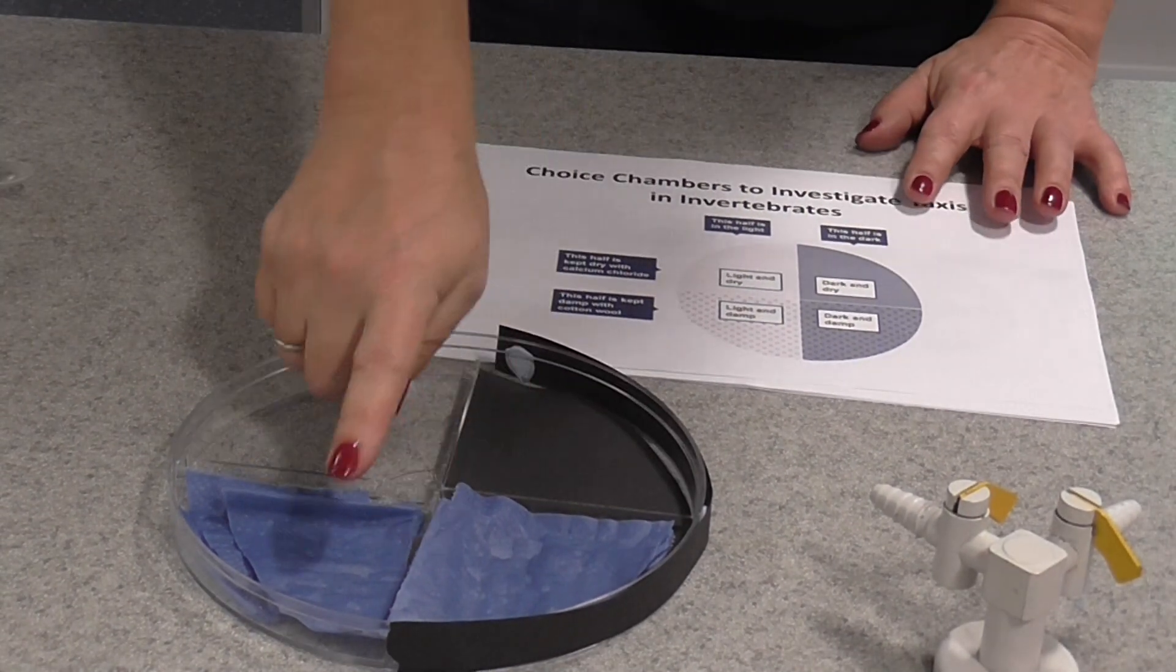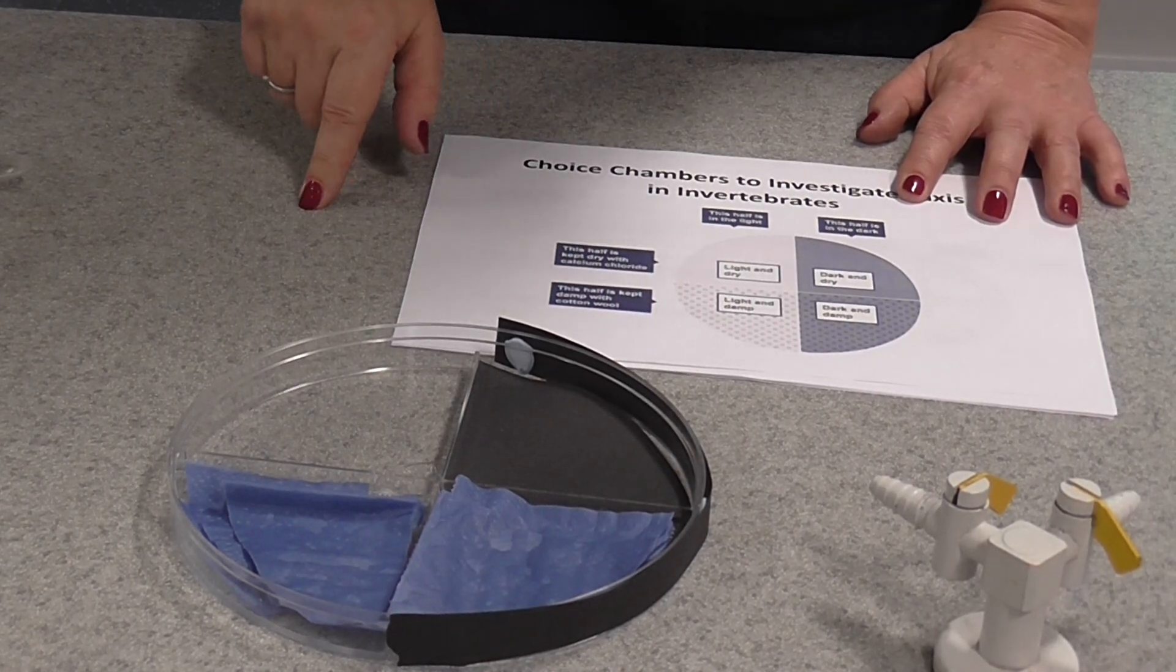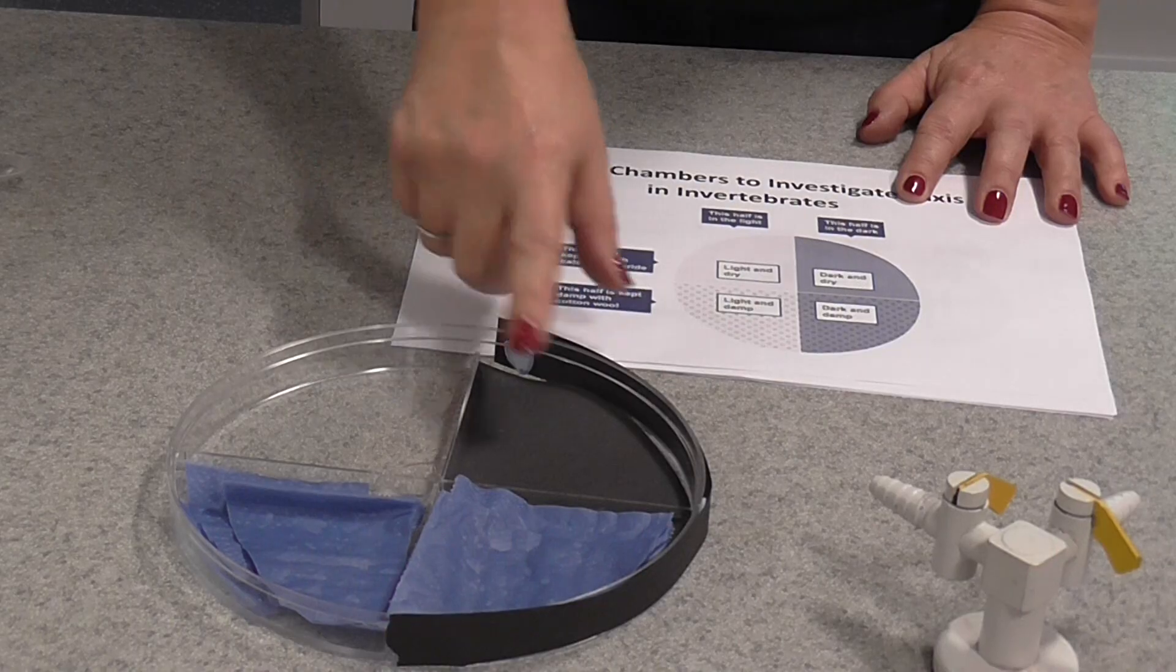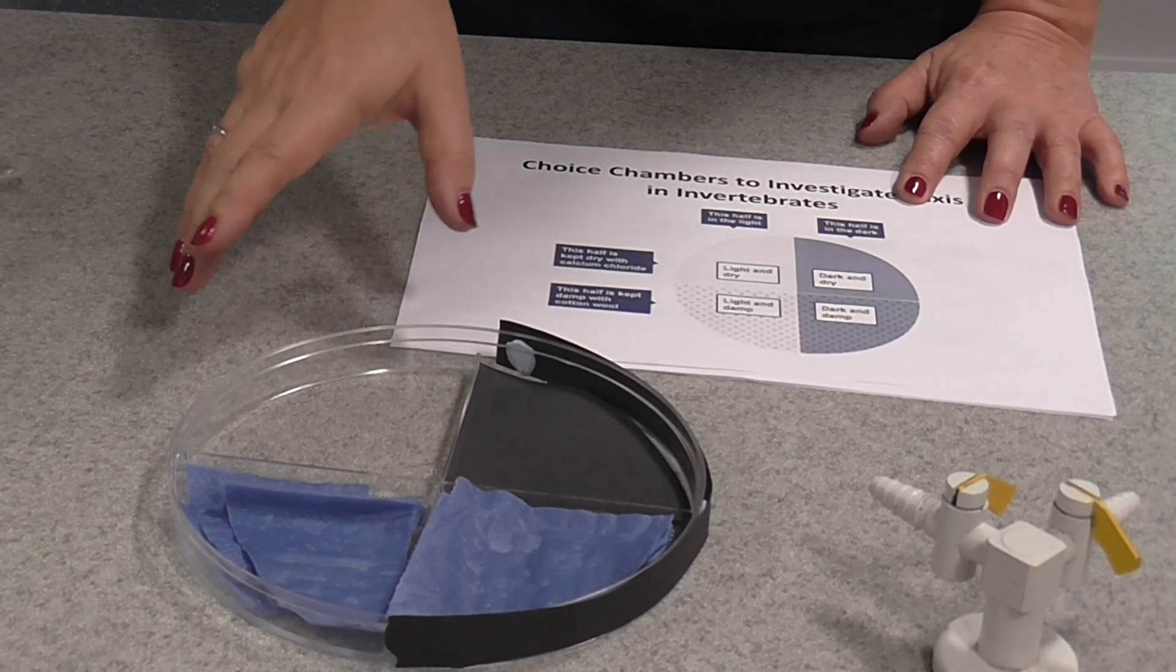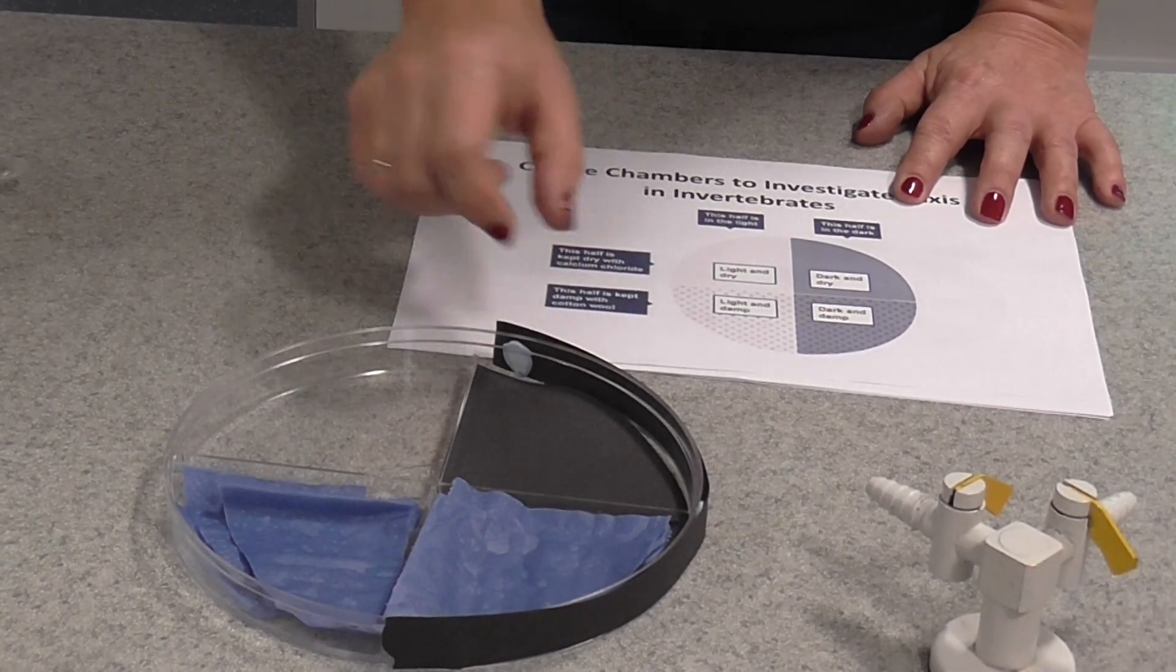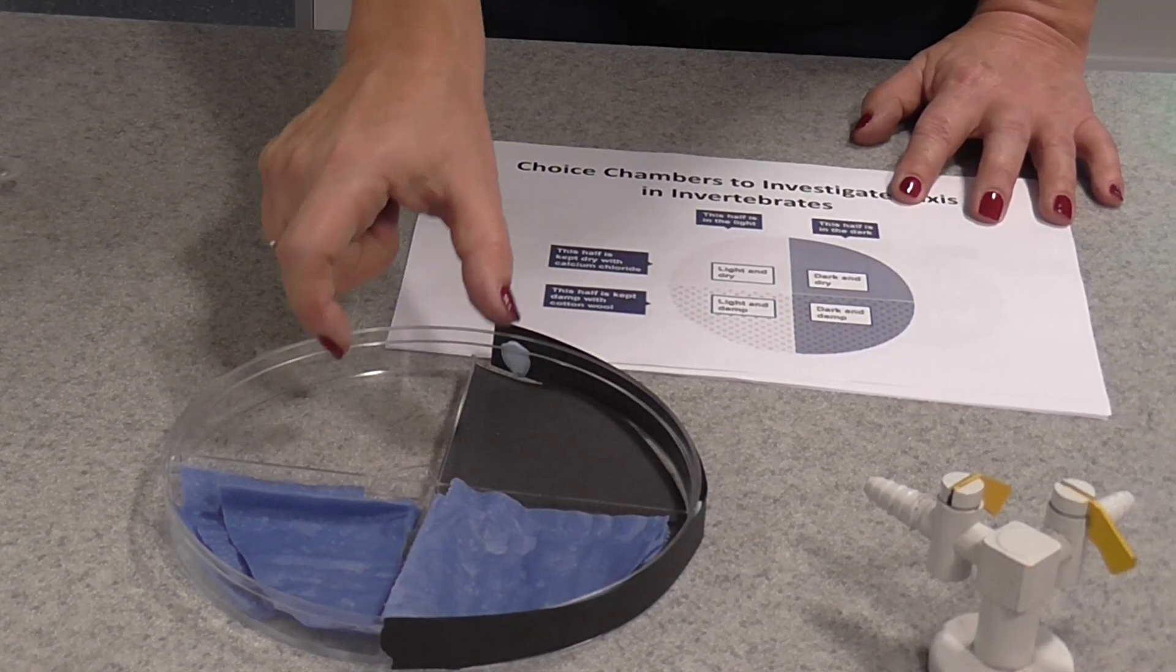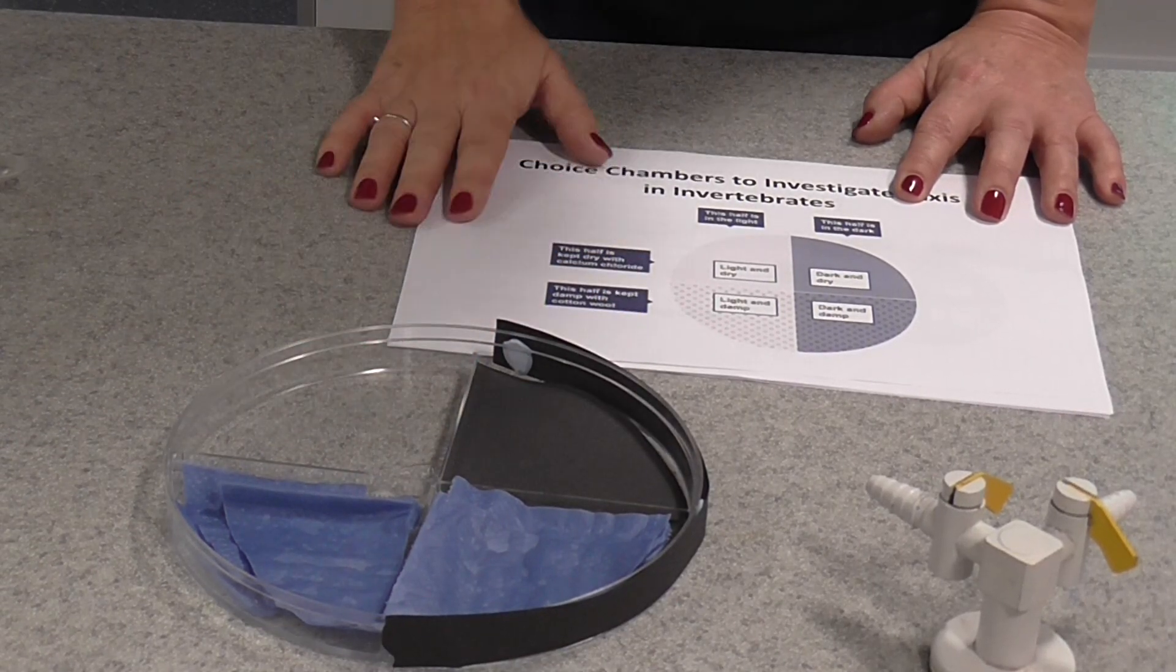I've created two damp sections by placing damp paper towel in the bottom there and two dry sections. In the dry sections, you can actually place some silica gel if you like to ensure that conditions are dry and you could even put something like cobalt chloride paper in there, which remains blue if conditions are dry, just to check the conditions. But I find this is not really necessary.